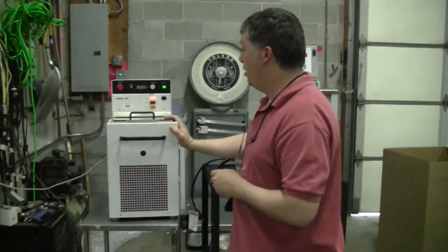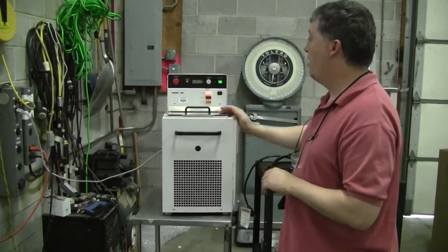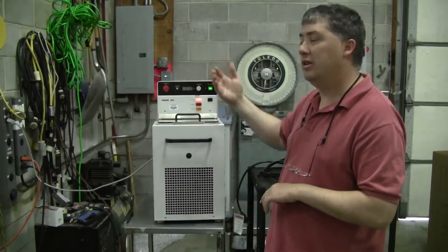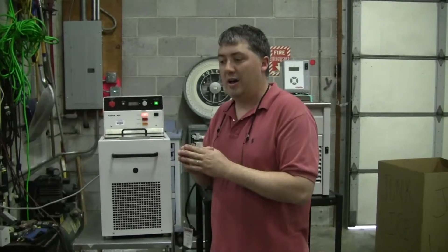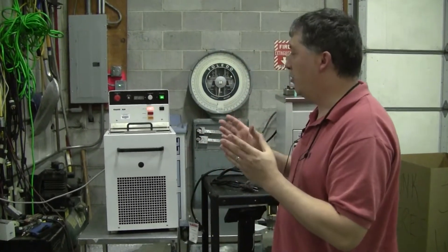This particular chiller has a set point of 21 degrees. I'm using the cooling, even though it's in a heating mode, to control the water temperature very accurately.